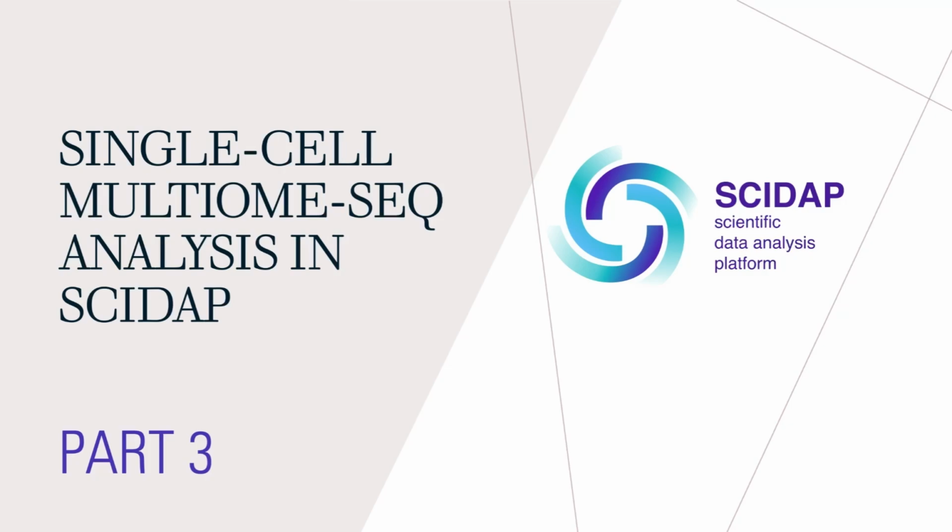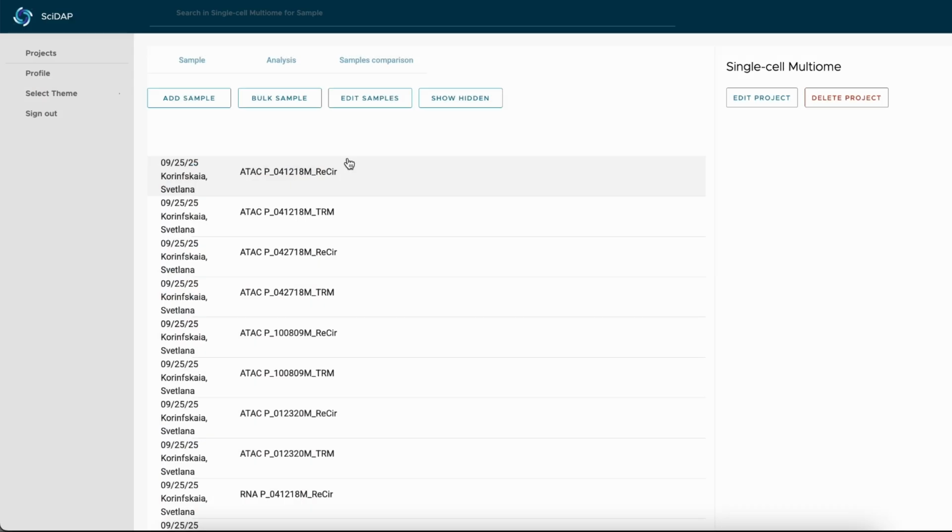You are watching the single-cell multiome analysis tutorial series with SciDAP. In this quick video, we will review the output of our FASTQ download pipeline.